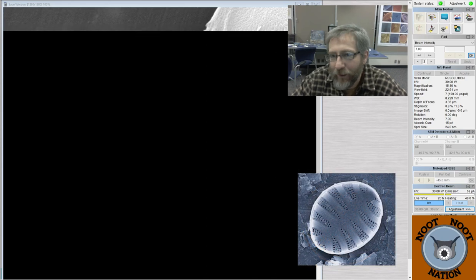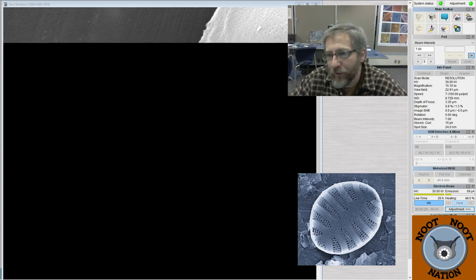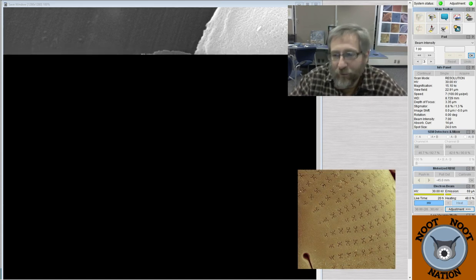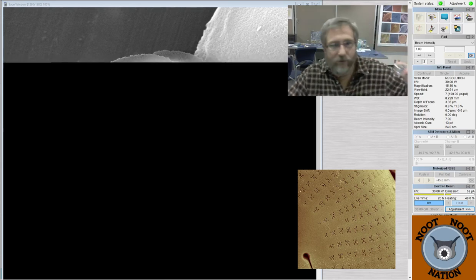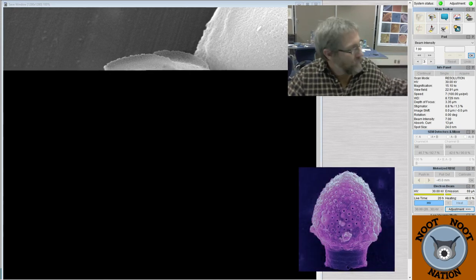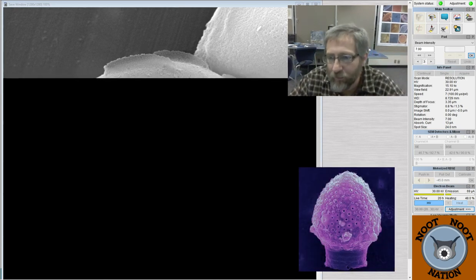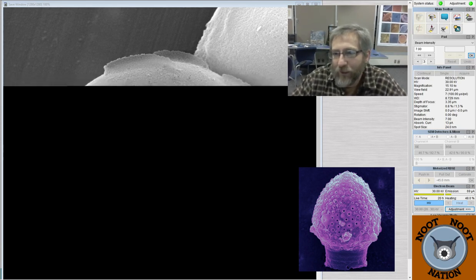Proper copper, why are you asking us physics questions? I remember coccolithophores, those are in the marine realm. I could put some on if you wanted to. This whole stub here is all full of coccoliths. In our department, there's another person who studies those, and sometimes you'll see them in the little images that I've colored below.